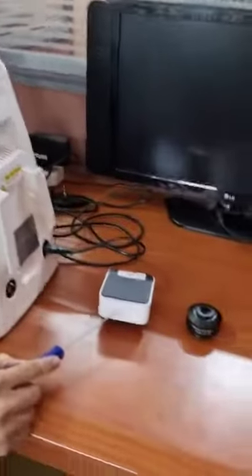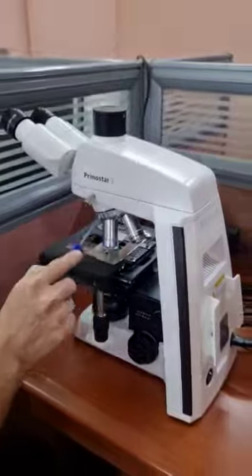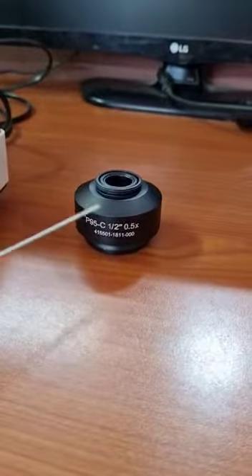Fixing of a C-mount camera onto Carl Zeiss Trinocular Microscope model Primostar 3 with the help of a C-mount camera adapter.